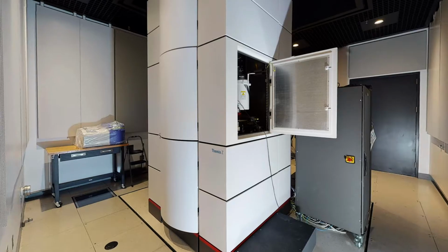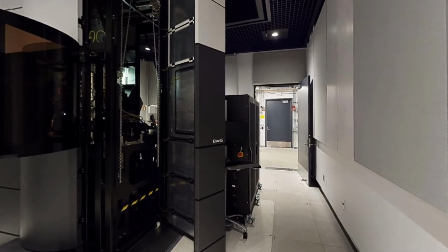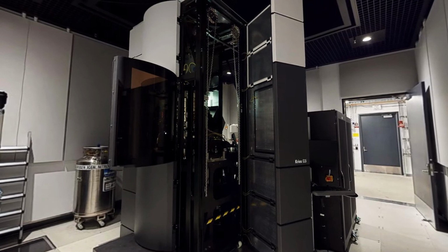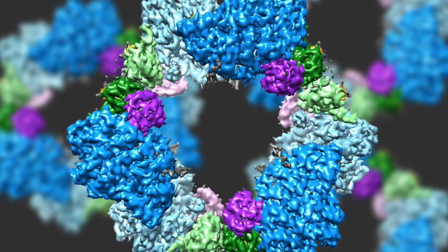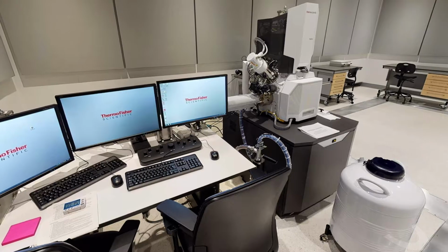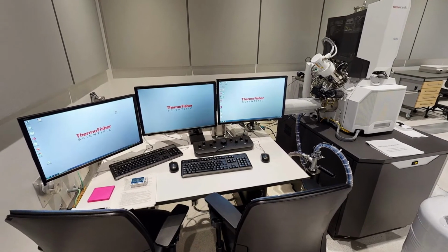What do we put there? An aberration-corrected, scanning transmission electron microscope capable of making movies of atoms. A cryo-transmission electron microscope capable of creating this 3-dimensional representation of an enzyme measuring less than 20 nanometers across. And an array of other powerful instruments that enable researchers to see and measure the smallest structures in nature.